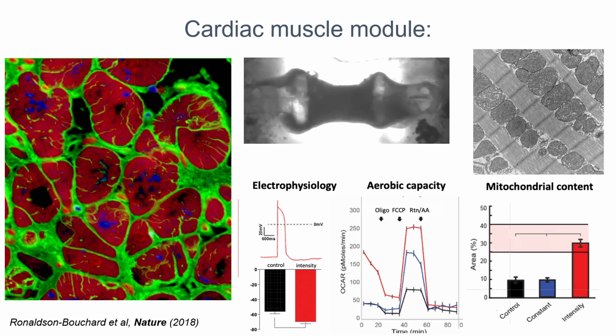Then we start stimulating this muscle, conditioning it by exercising it. Essentially, by electrical signals, we make the muscle twitch, the same mechanism that our heart is using to pump blood, to twitch and pump blood. And actually, this stimulation is being applied at an increasing intensity. So we exercise the muscle, and this is what makes the muscle stronger.